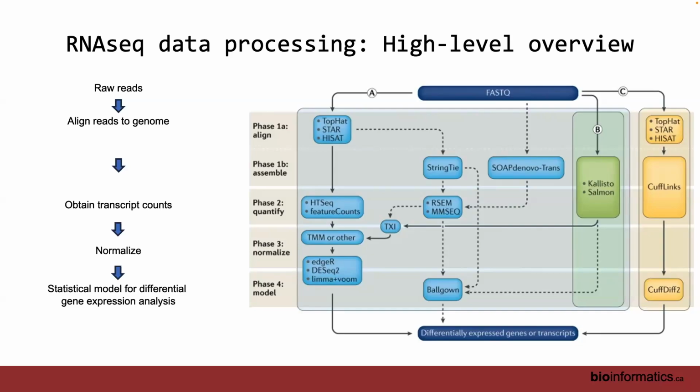The normalization I'm talking about here, so for example, in your case, you mentioned using the housekeeping gene as a loading control. Their variation comes from how much you're loading in your pipette, right? Yeah, so you're normalizing to that. Here, the variation comes from sampling differences for sequencing, so you normalize to the total number of reads. The assumption is there's no inherent reason why, systematically, the cell should have across the board more transcripts than that.